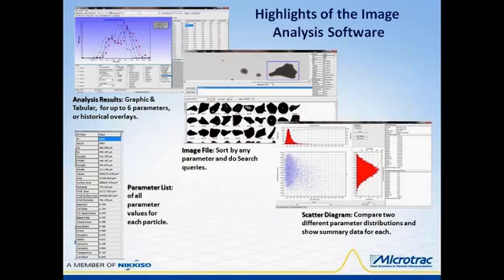The scatter diagram can be used to also create classifications or compare 2 different parameter distributions against each other. At the far left is a list of all parameter values that can be called up for any particle in the saved video file. And the video file can be remeasured any time under a different analytical set of conditions than it was originally run under. This is a great tool for method development.